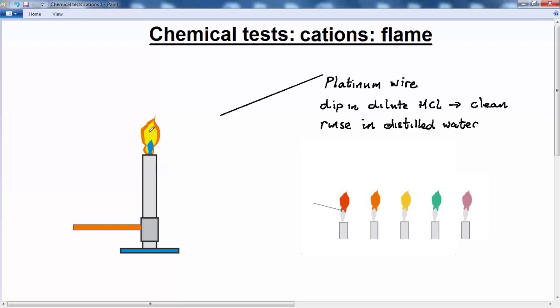Now the Bunsen burner flame—normally when you're not using it, the hole should be closed so the flame is a nice bright yellow-orange so you're aware the flame's there. But when we're doing this test, we want to open the hole so we get a hotter, bluer flame, and as a result it's easier to identify the different colors produced by the samples we're testing.